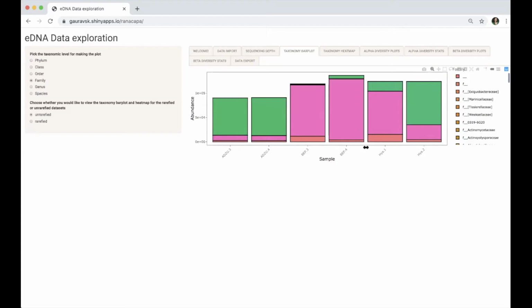So for your report, some things that you might want to mention and talk about is you want to compare your different samples, compare the different taxonomic levels, and you could compare how similar your replicates are. So in this example here, my two Adzuki replicates are very similar. We have Enterobacteriaceae, Staphylococcaceae, and some sequences that were not able to be classified at the family level. So it says unknown. That's fairly common. So you might have some of those as well in your data set.